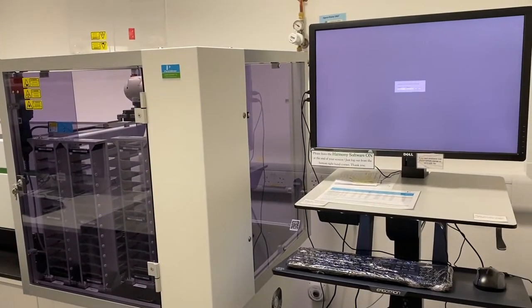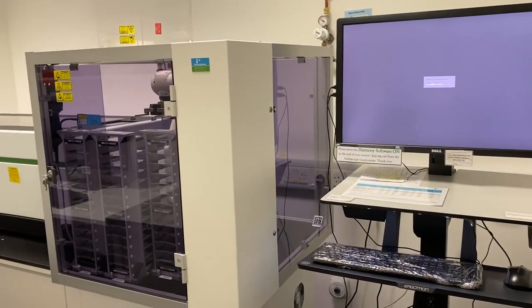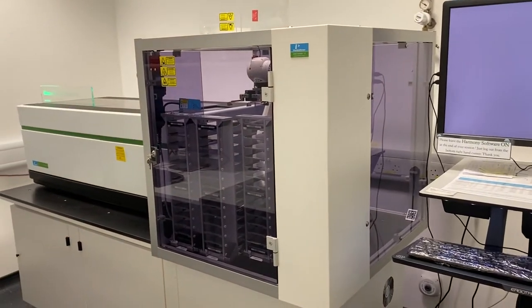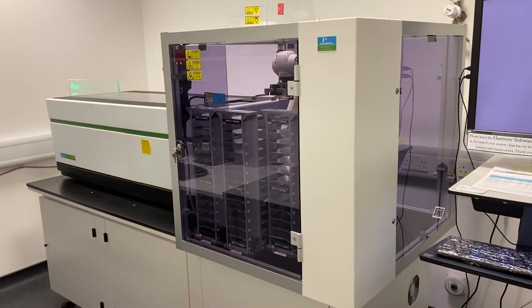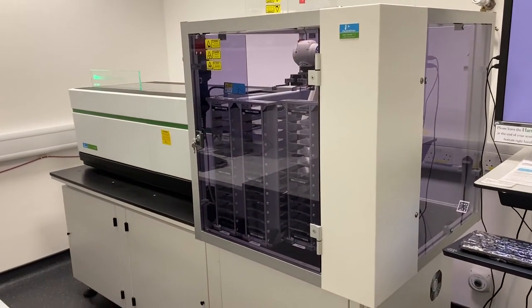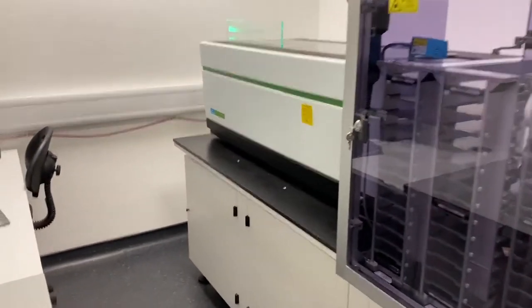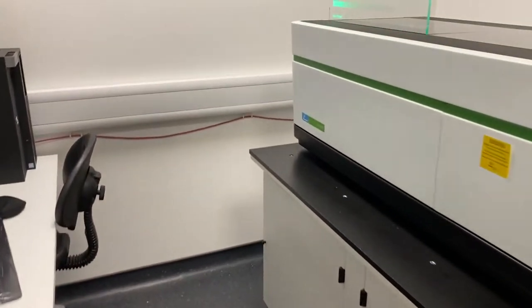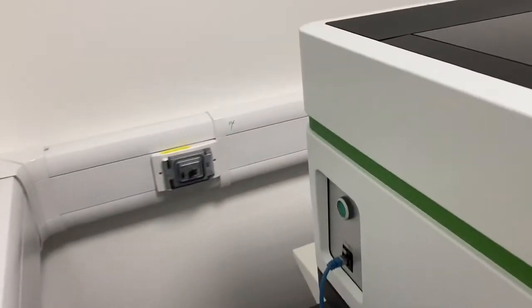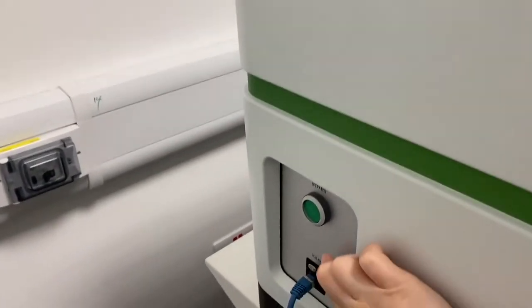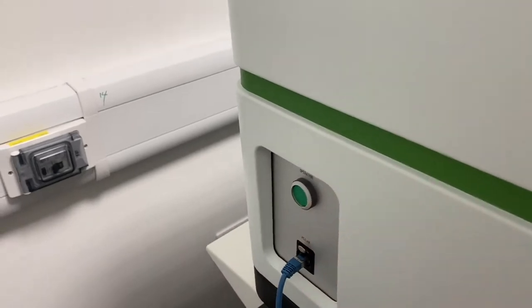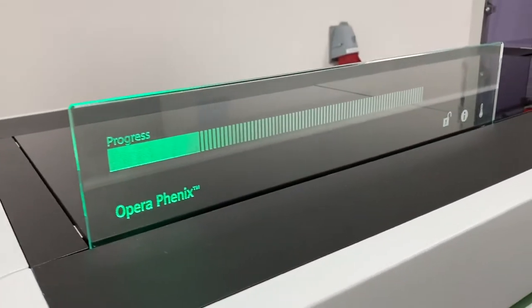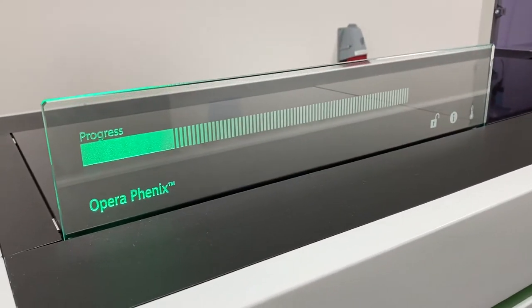But if you do need to switch it on yourself, you want to come over here to the side, press the green button to switch on the Opera Phenix.